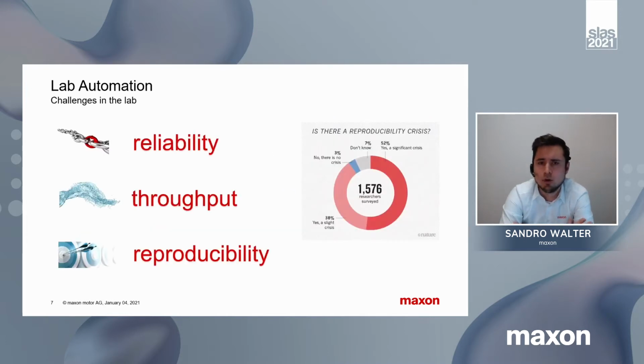So what are the challenges and important things needed in the laboratory process? To perform a large number of analyses in a short time and to handle the increasing number of test samples, laboratories need accurate and highly reliable data. To achieve this, labs have installed automated sample transportation lines and automatic analyzers. This leads to the need for reliable automation systems that always perform the same way to have a high reliability. Another reason why automation is important in the laboratory is the need for higher throughput volumes. Automation increased throughput times and accelerated research processes.